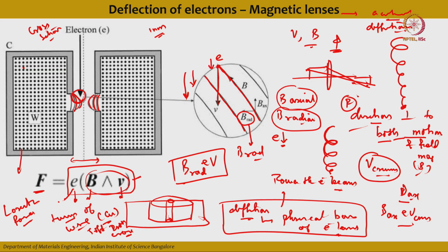Your magnetic field should have an optimum strength, size and shape, so that it applies the magnetic field homogeneously across the circumference of the column.